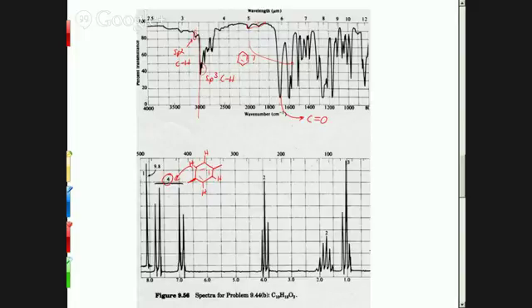Now, the other thing you need to know about that aromatic region in the NMR, those special types of rings, those aromatic rings with alternating double bonds, which we will get into a little bit in the next chapter, cause all kinds of unusual behavior in the NMR. They cause the hydrogens to be able to split beyond 3 bonds. They can actually split across the ring and all kinds of stuff. So often that region will be a mess. It'll have a bunch of different little peaks there.